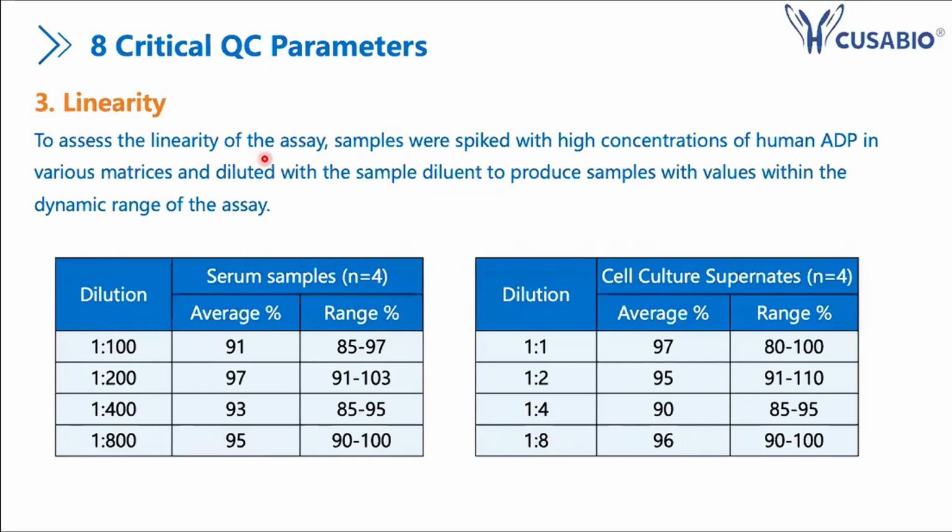To be simple, the concentration of the target protein will be determined by multiplying by the dilution factor to get the final concentration. So for the best result, we want the concentrations of the sample from different dilution groups to be similar for all these dilutions.